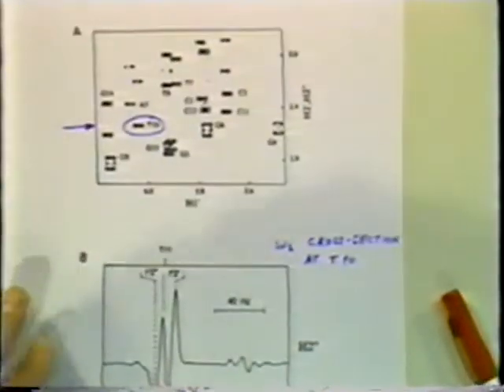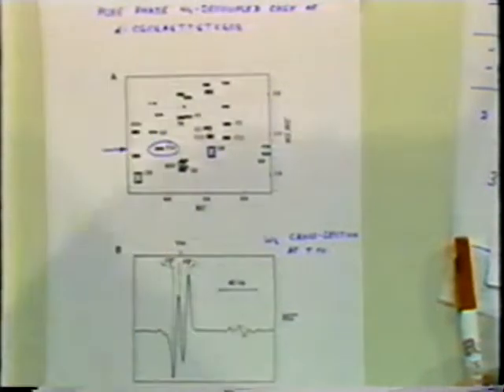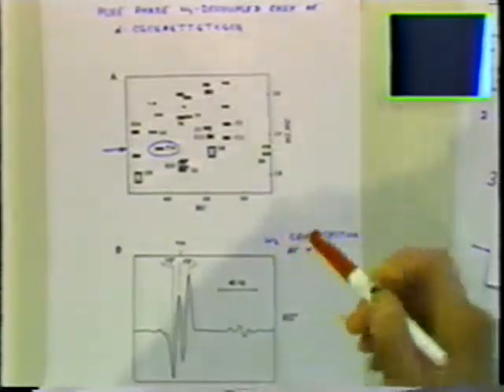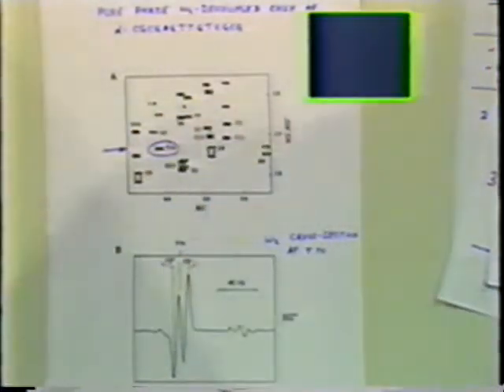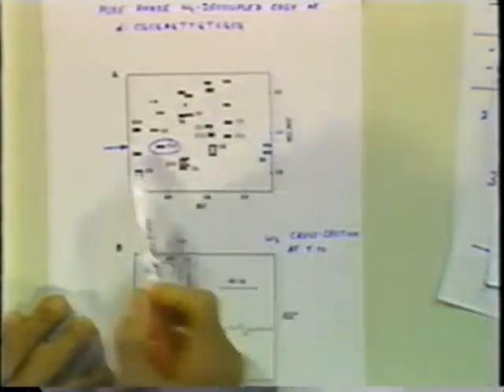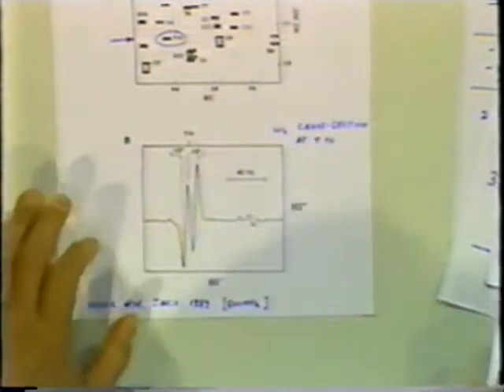The result of this experiment is quite good, as shown in the last transparency. An experiment has been done by the Bombay group on oligonucleotide. They specialize and do a lot of experiments on oligonucleotides. One can see that it's decoupled in the omega-1 direction and not decoupled in omega-2 direction, which is very good, but one can still read the coupling constants out of it. If you take a cross-section at one of these cross peaks, shown in the lower diagram, one can measure coupling constants out of it. And that's nowadays routinely done.